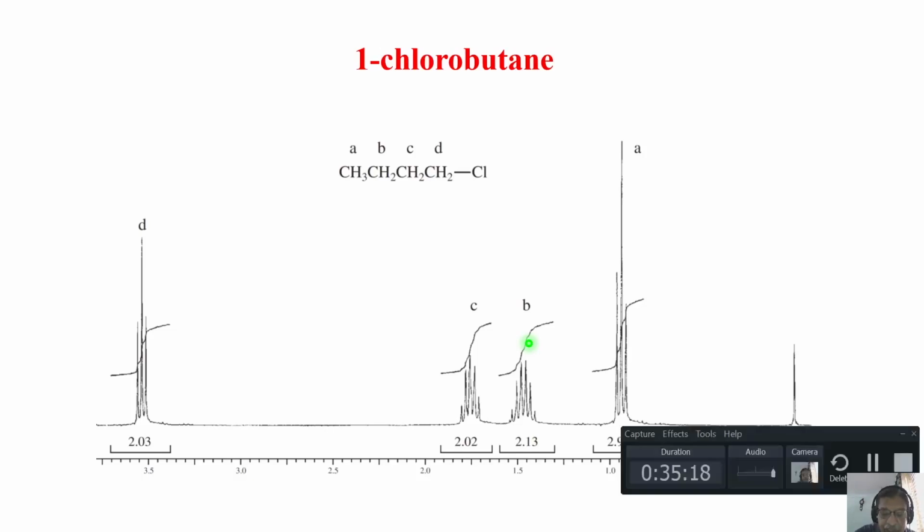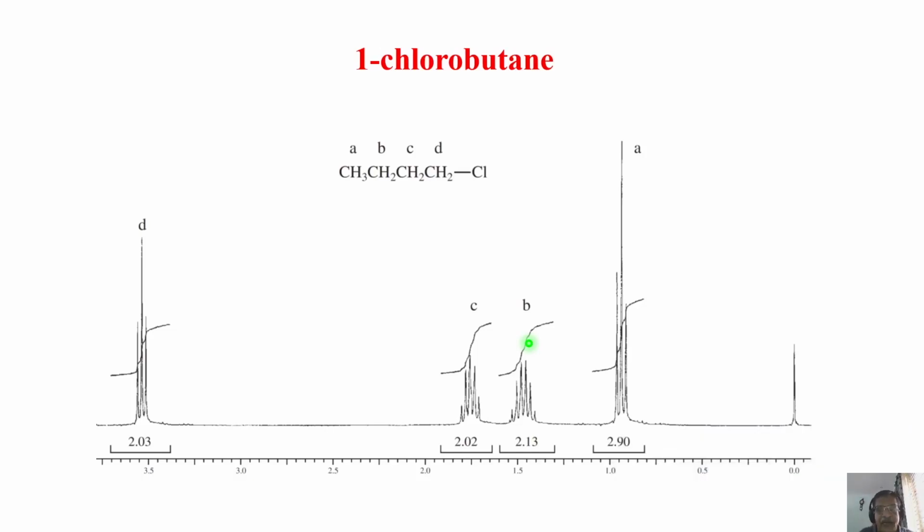I will stop with this analysis today. We'll come back tomorrow and continue with the interpretation of more complex molecules. In the next one or two classes, I'll spend more time on analysis so that you get a feel for it. Finally, you will get a molecule of your interest, you synthesize it in the chemistry lab, come back and take the spectrum of an unknown molecule.